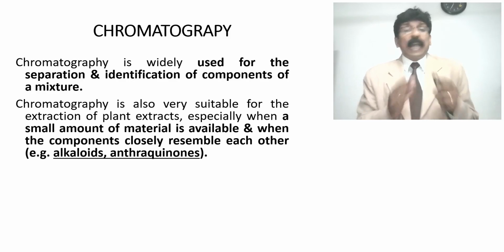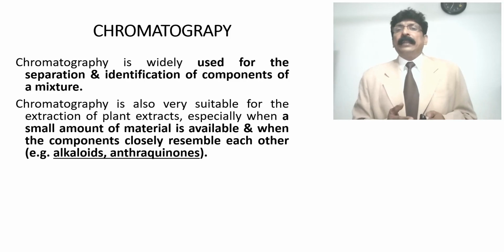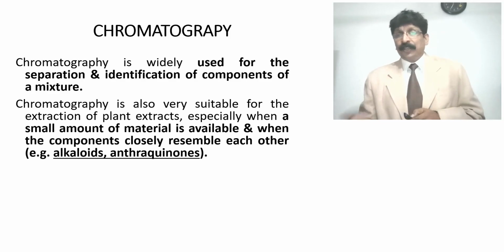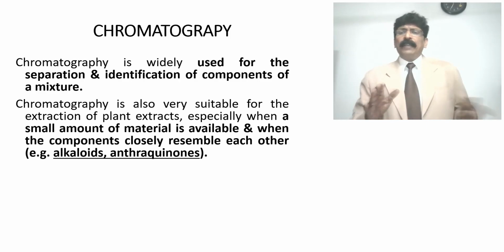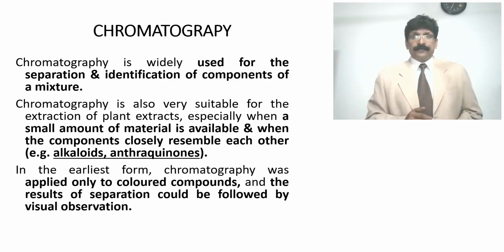Very minute separation can be done by chromatography. Examples are alkaloids, anthraquinones, quinones. These all have structures and characters that are nearby, and can be separated even by chromatographic techniques.